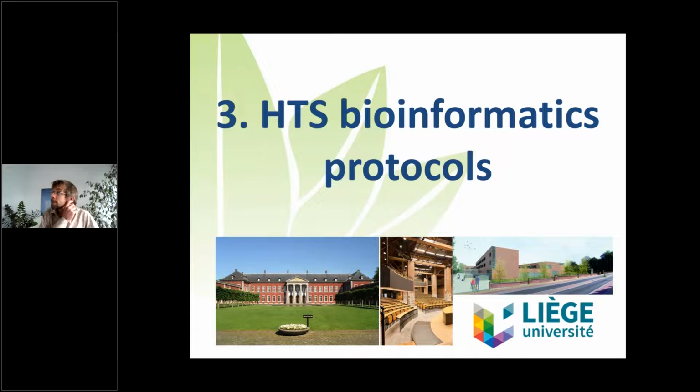Yeah, so the question is: is it possible to sequence a degraded RNA? In fact, yes, because even if you have long RNA, you need to shear it into small pieces before sequencing it. So it will be sheared, but it is sheared in a very controlled way. The intensity of the protocol is adjusted by the person preparing the library in order to target a certain length of the fragments. And for Illumina, the best is around 350, 400 nucleotides on average, more or less. It allows you to have the highest yield on your flow cell.